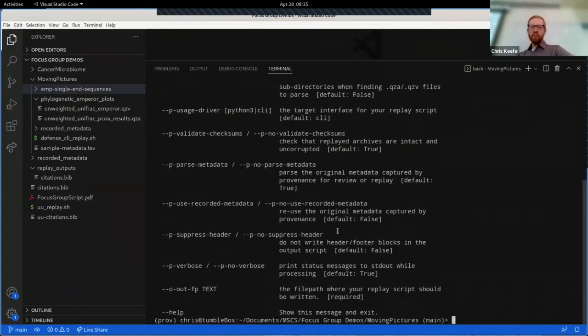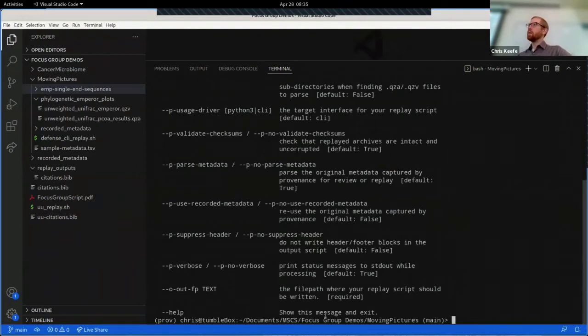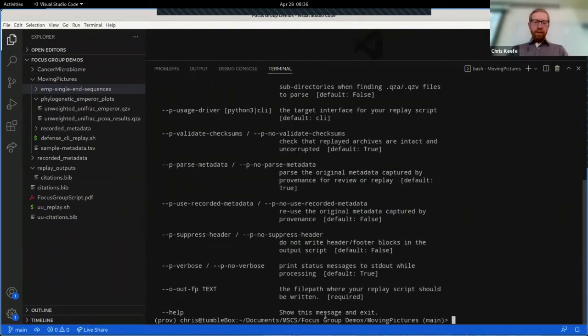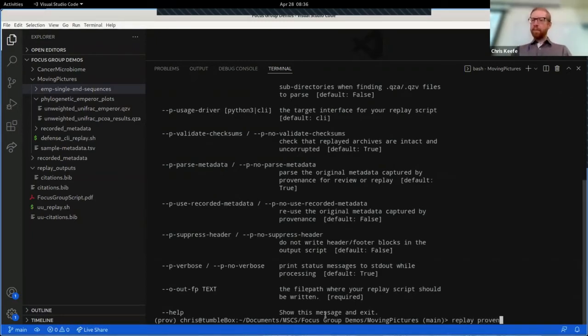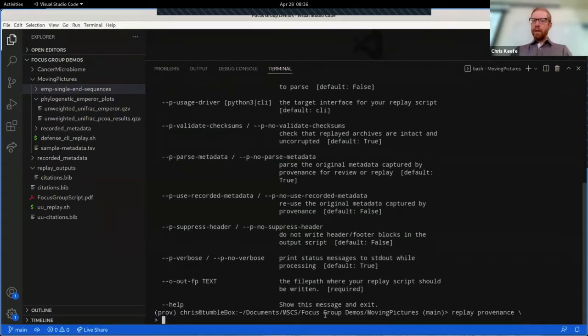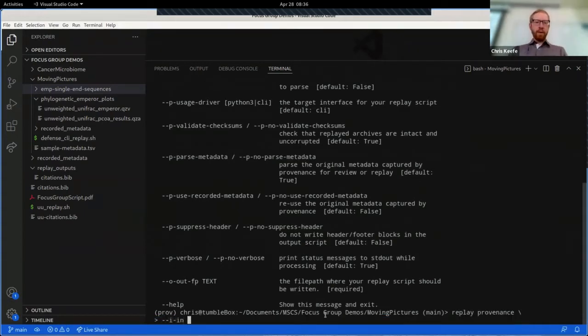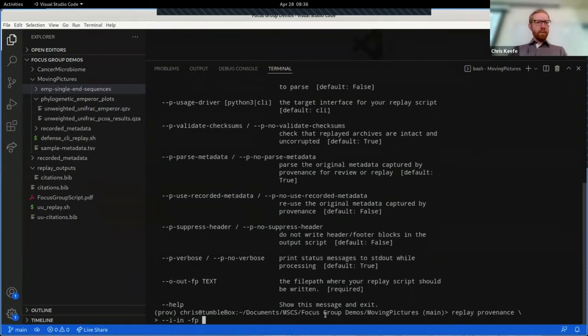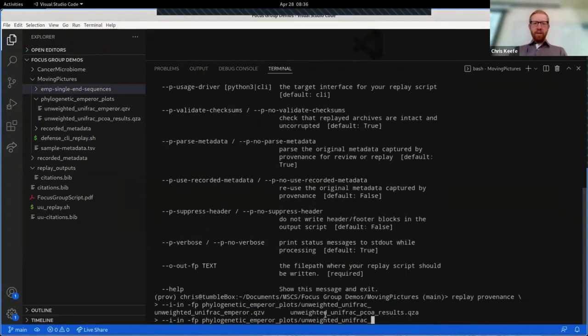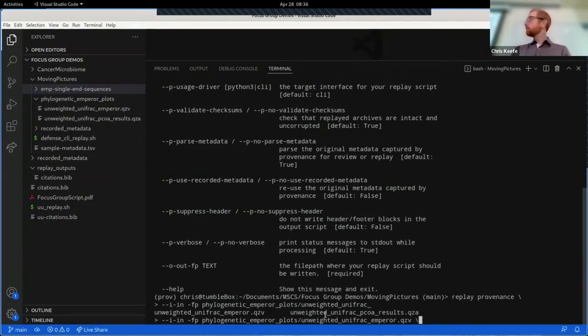So in order to run provenance replay, all we need to do is pass in the results we want to replay and where we want to replay them to. I'll do that right now. We'll start with the replay provenance command, and I think we're looking for something in phylogenetic emperor plots, weighted unifrac emperor.qzv. We're just using tab complete like we usually do.